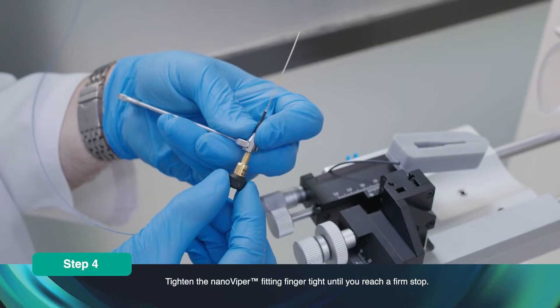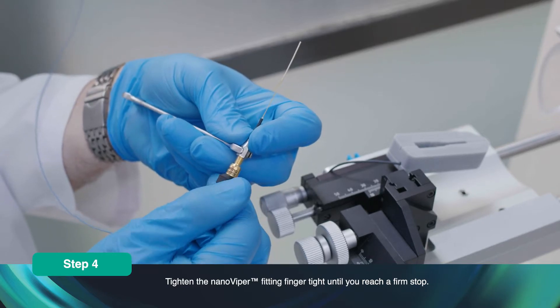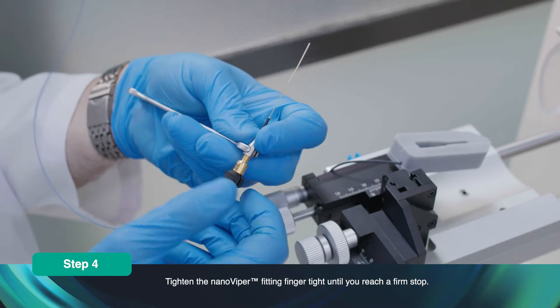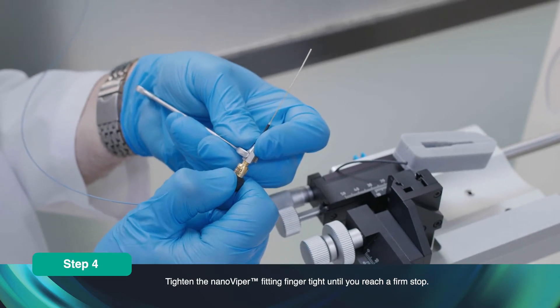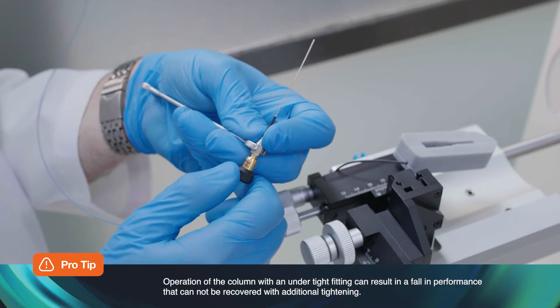Holding the Nano Zero with a spanner, tighten the Nano Viper fitting finger tight until you reach a firm stop. Operation of the column with an under-tightened fitting can result in a fall in performance that cannot be recovered with additional tightening.